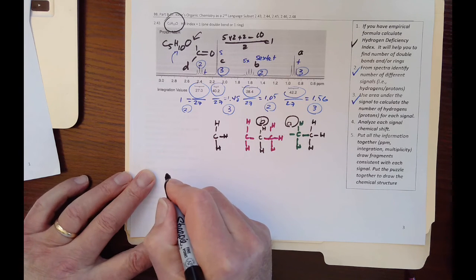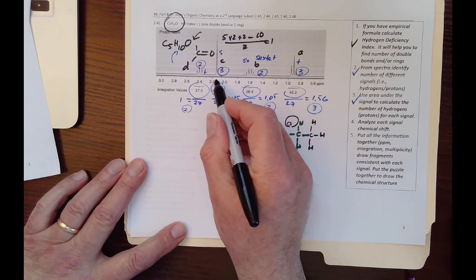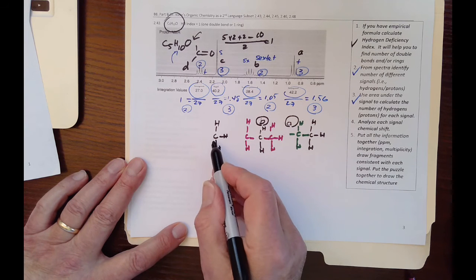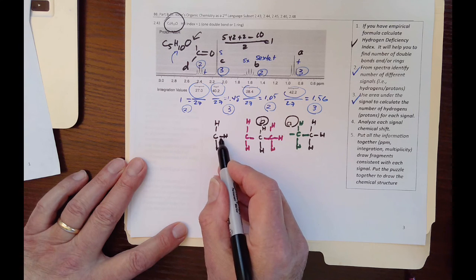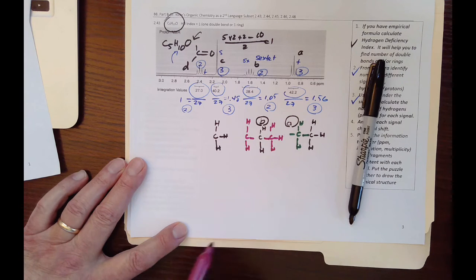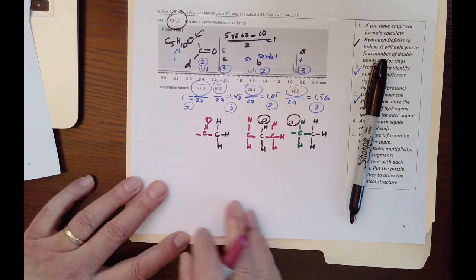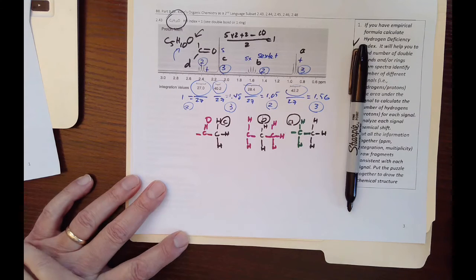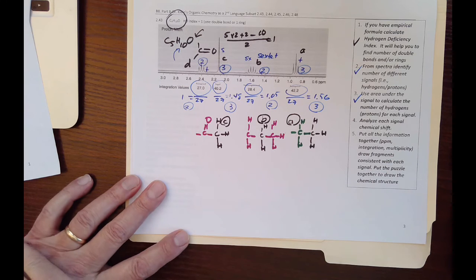We look at the ppm. The ppm is 2.19, 2.18, close to 2.2. Remember, CH3 by itself is 0.9. Now it's downfield, added ppm to it. So most likely, this is the one next to the C double bond O. If I put a C double bond O for C, look at that now. It's a singlet. It doesn't have any proton next to it to split it. So far so good.